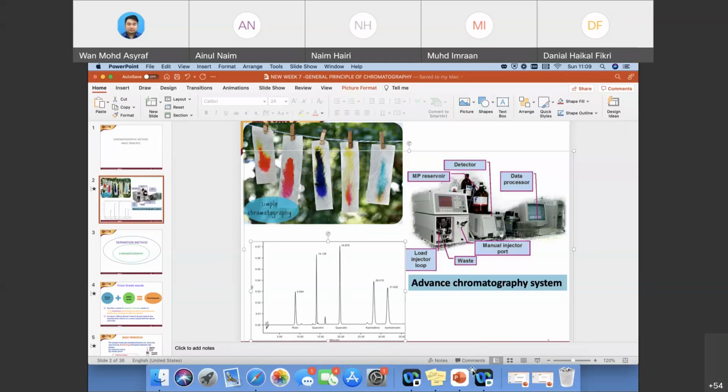So now your sample, for example, for this one, is maybe a plant sample. Okay, so now inside the plant sample, you have rutin, you have quercetin, and whatever else we have back here. Right, so basically inside your sample, it is not just your analyte, it also has a variation of analytes, which can be separated and identified as well as quantified at the end.